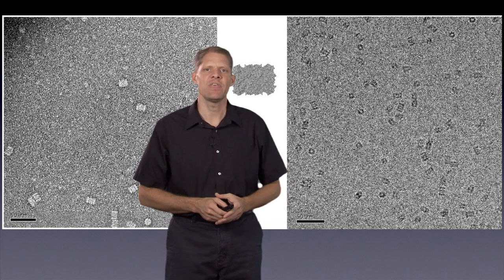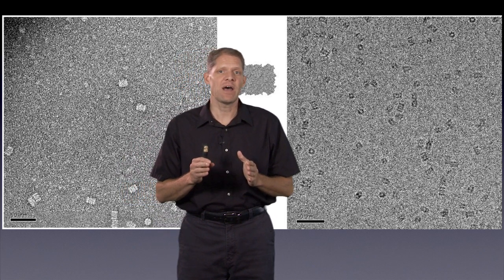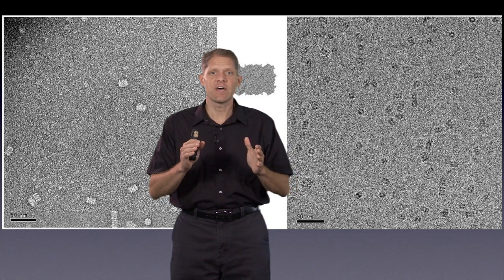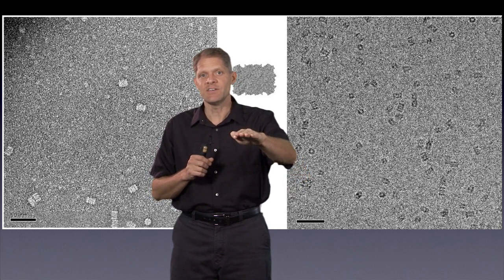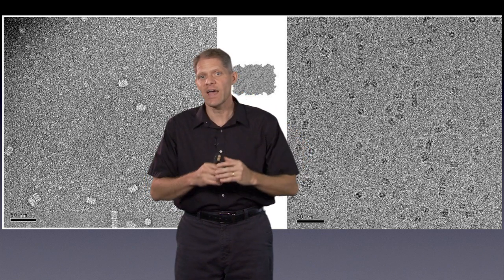And we'll talk more about that problem in a second. So plunge freezing is a powerful strategy to preserve biological structures in a native state. And it works most easily for samples that are already thin enough that they can be placed directly into the microscope. Remember, that means thinner than about 500 nanometers or less.